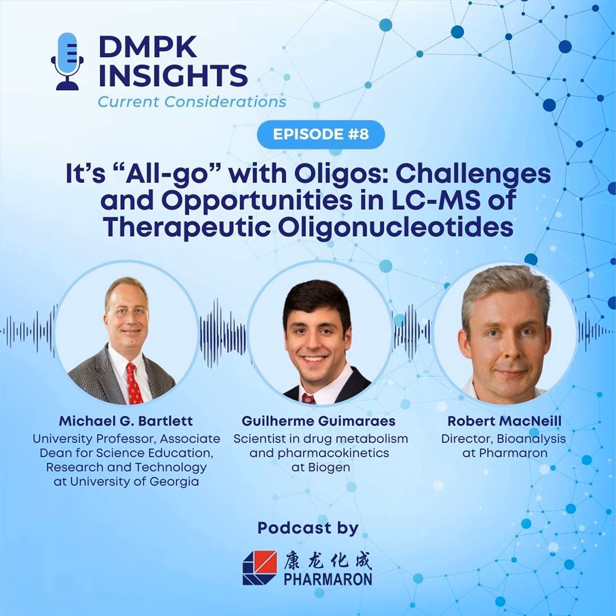But I would say that, I have looked substantially into the options of HILIC columns in the microflow range. Not a ton of options, but I expect that to be changing soon. And as more and more research comes out, it will be interesting to see what kind of options would be out there for method development. And tying into what you just said to some extent, when you mentioned the loss of sensitivity through difficult fragmentation, you start thinking about losing the tandem aspect and using high resolution to do, say, TOF-MS, and use that as your quantitative detection means.